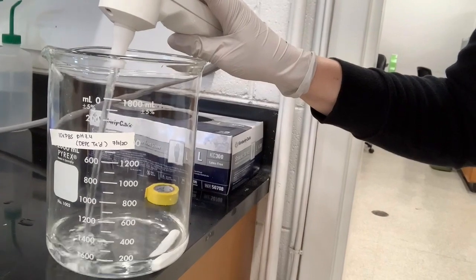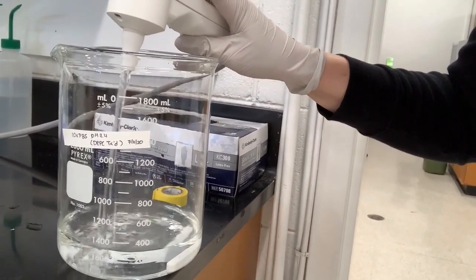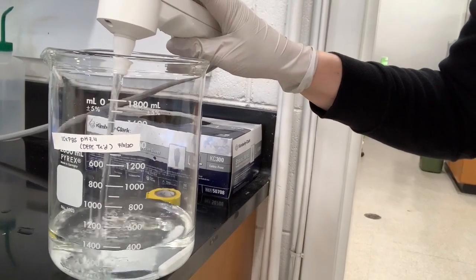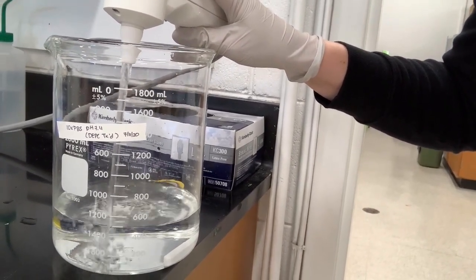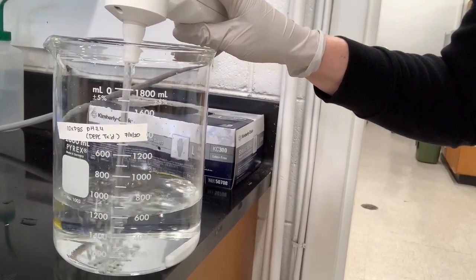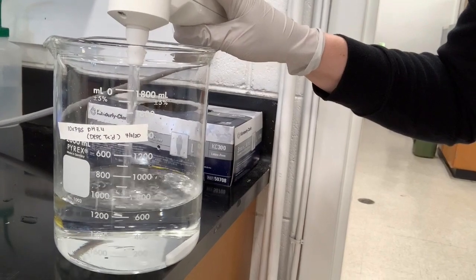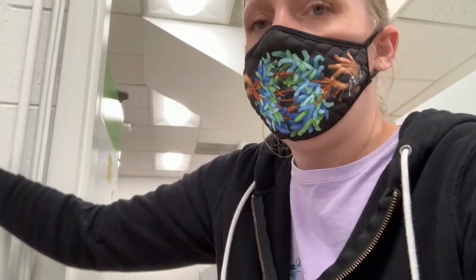I said that we're going to make a liter, but you never want to go ahead and put that amount of water in the solution because you're going to add the powders and you're going to need some space to pH. So I often start out by adding somewhere around a little over half or 3/4 of the volume of liquid that I think I will need.